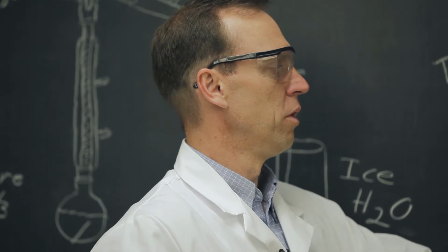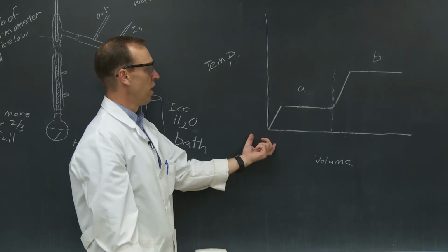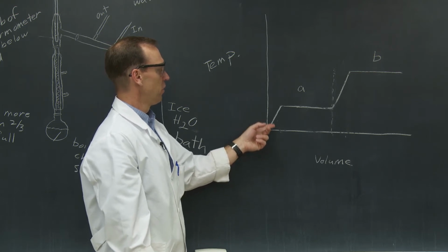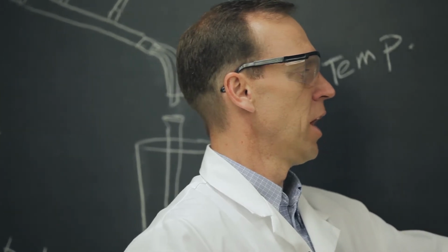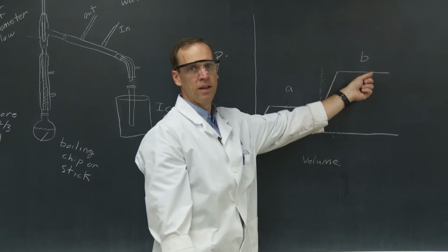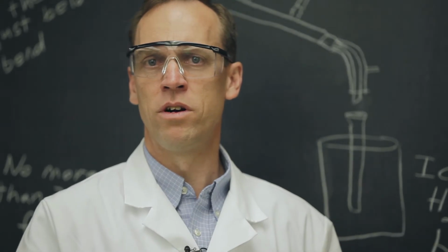As you complete the lab, you're going to be asked to determine, one, the boiling point of each of your components and the relative ratio of A to B. To determine the actual volume of A, go ahead and add the volume of the first few drops of A with the fraction that was relatively pure. And same thing over here, the few drops that were collected on your incline, combine that volume with your B to get your relative ratio. Relative ratios should be in the order of 1:1 or 1:2 or 2:1.